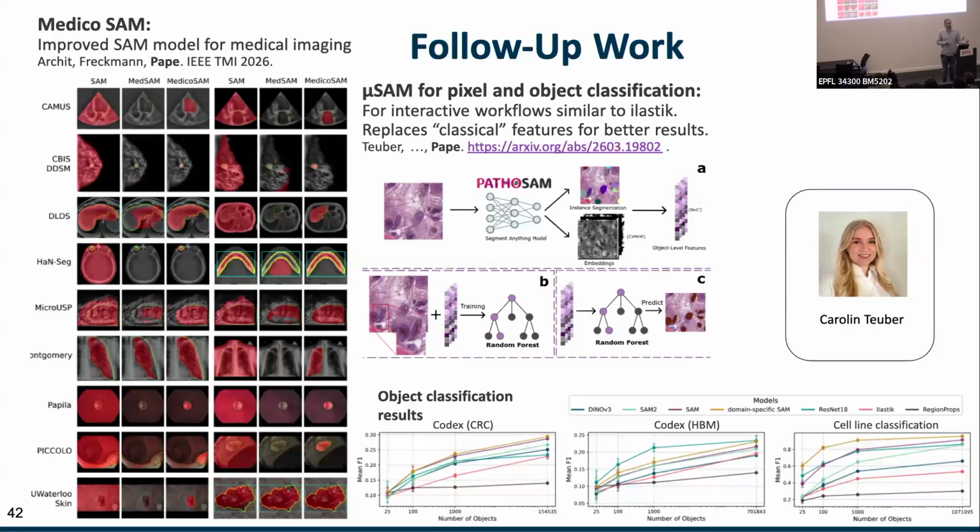Or you have to train another deep learning model from scratch for this, which can achieve quite high accuracy, but also requires a lot of work. And here, what we try instead now is basically to take the intermediate representations that this model has, extract them for each object that was segmented, right?